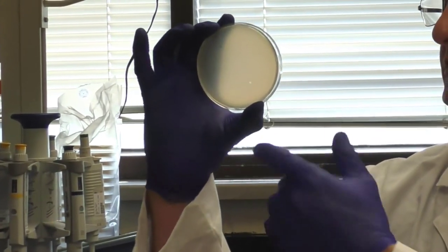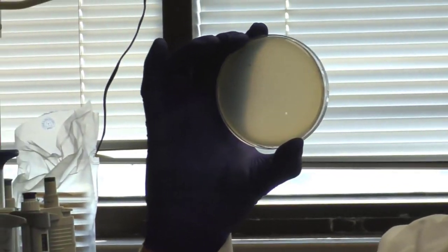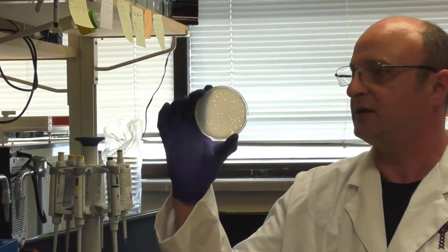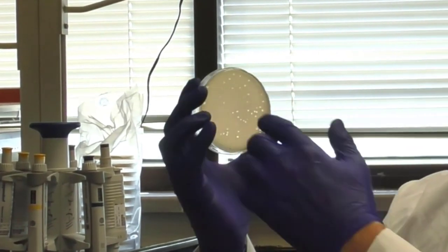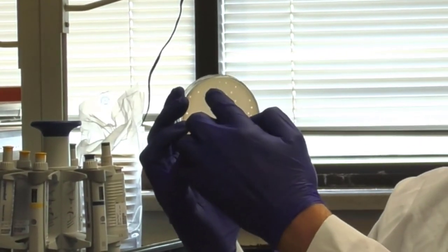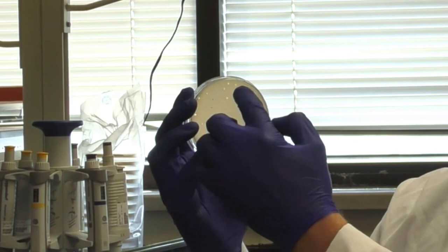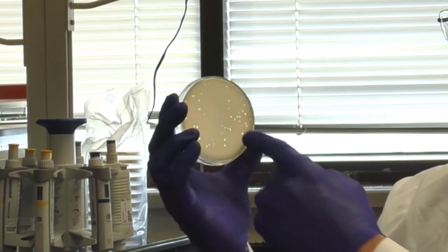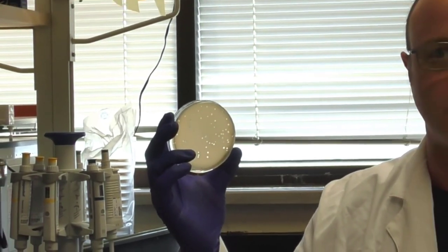And then to show you, this is the 10 to the minus 7 dilution. And as you can see, there's only 5 or 6 plaques on there. There's too few to count. Your data will be statistically quite meaningless. So we take our plate that we want, our 10 to the minus 6 plate. And then all we will do is we'll count. And we'll use a sharpie, and each time we count one we'll just mark it with a sharpie so we know it's counted and it doesn't get counted twice. Record that data. Now we have our plaques, you know your serial dilution, your dilution factor, and you know the aliquot that you spotted out. Now you have your results.